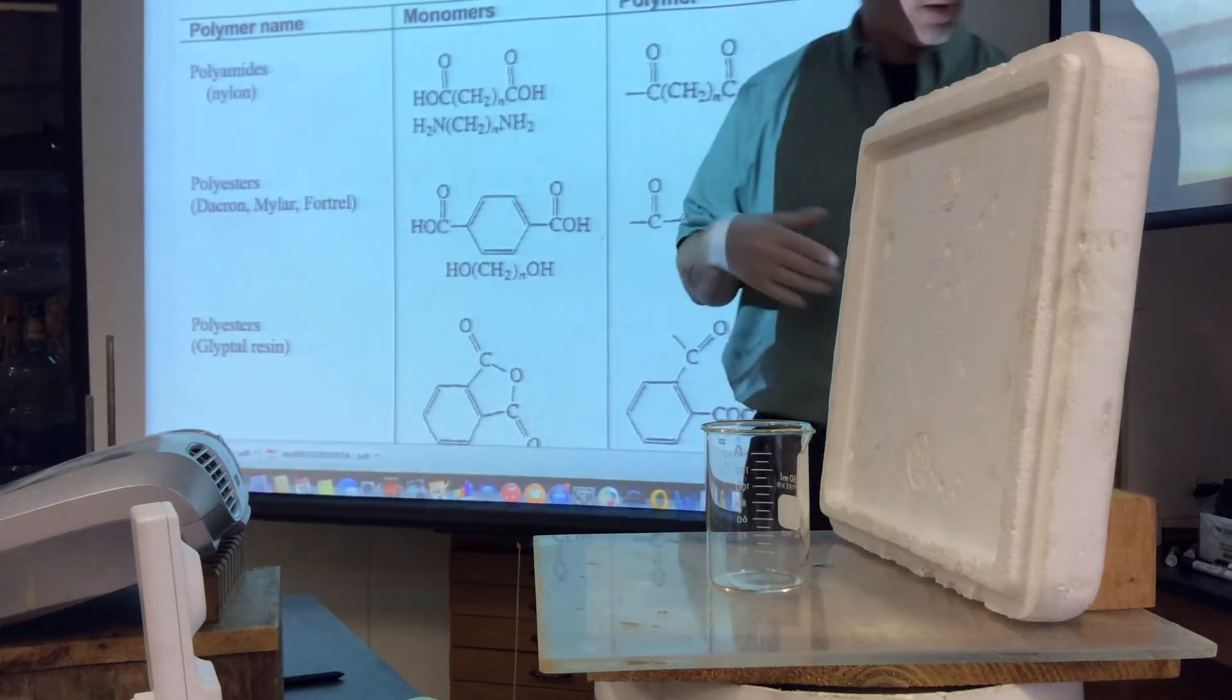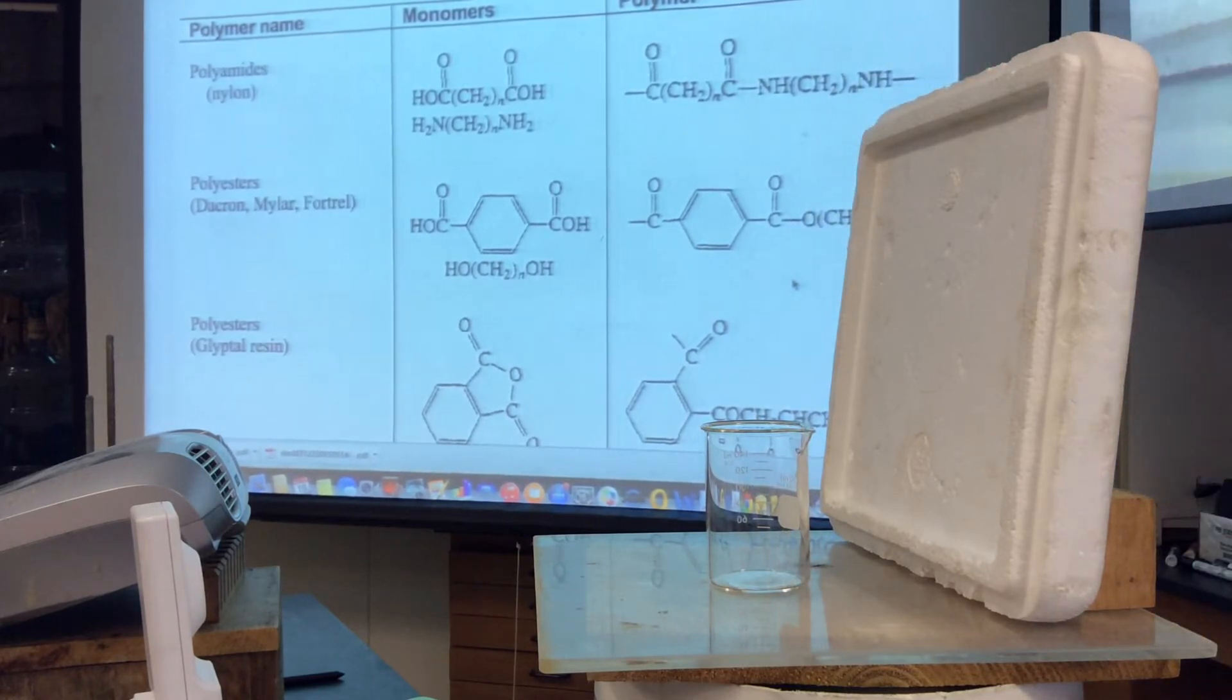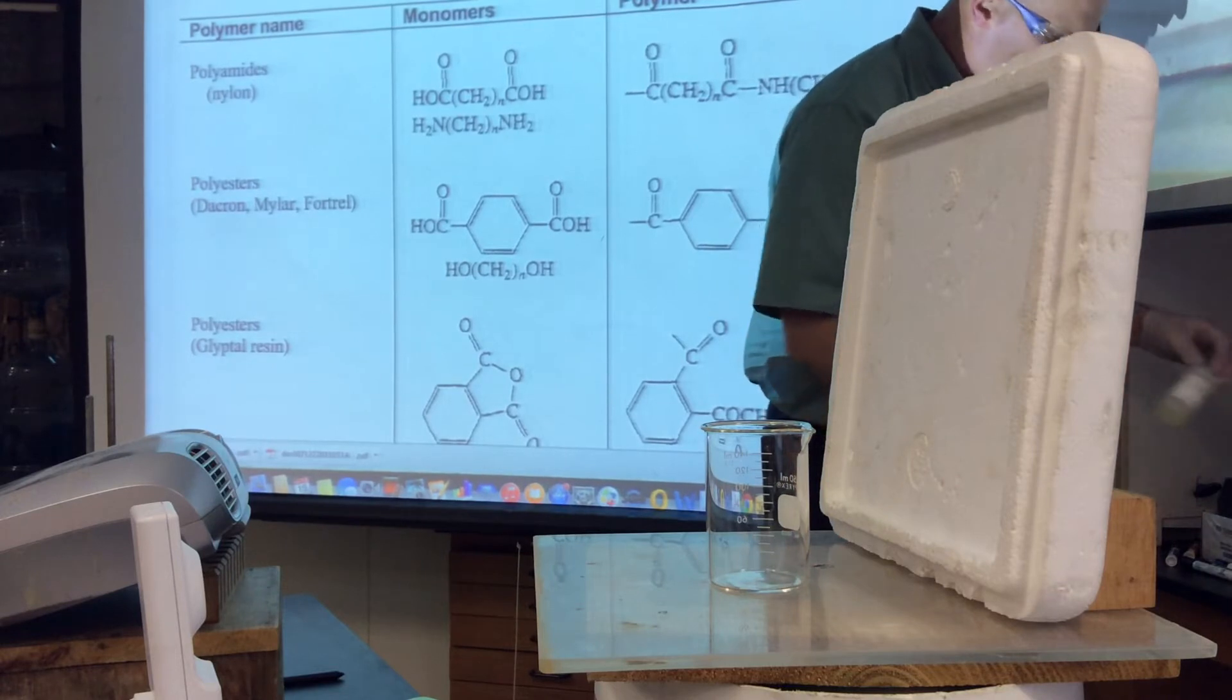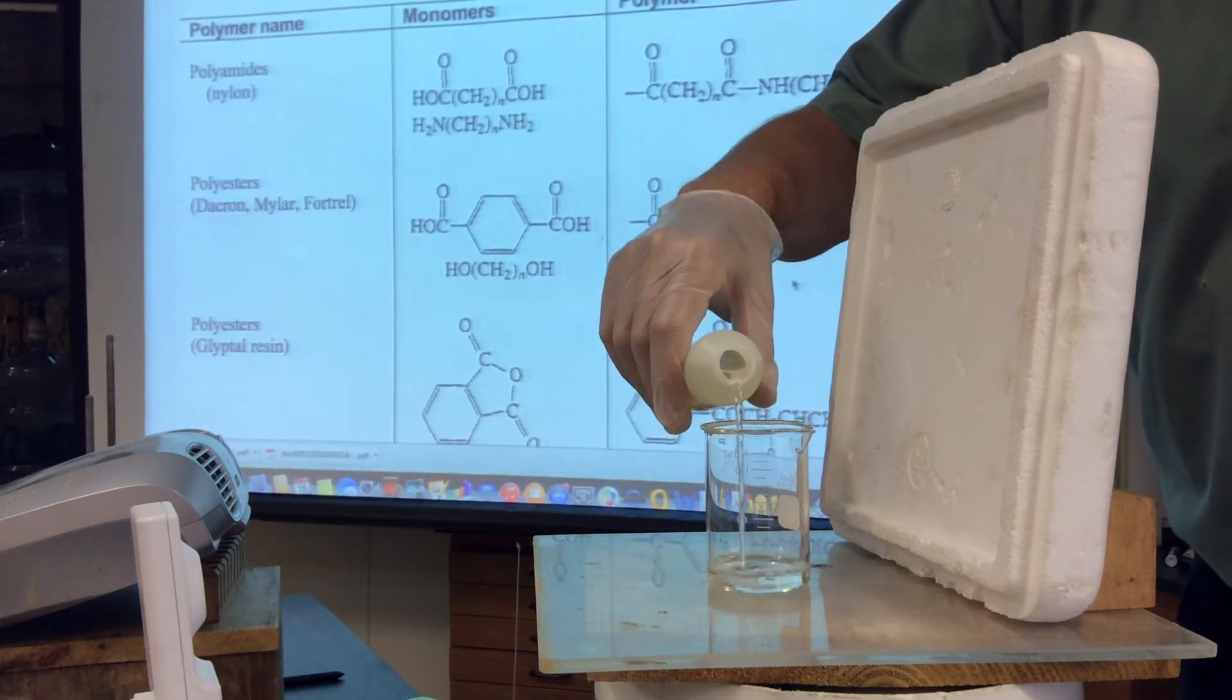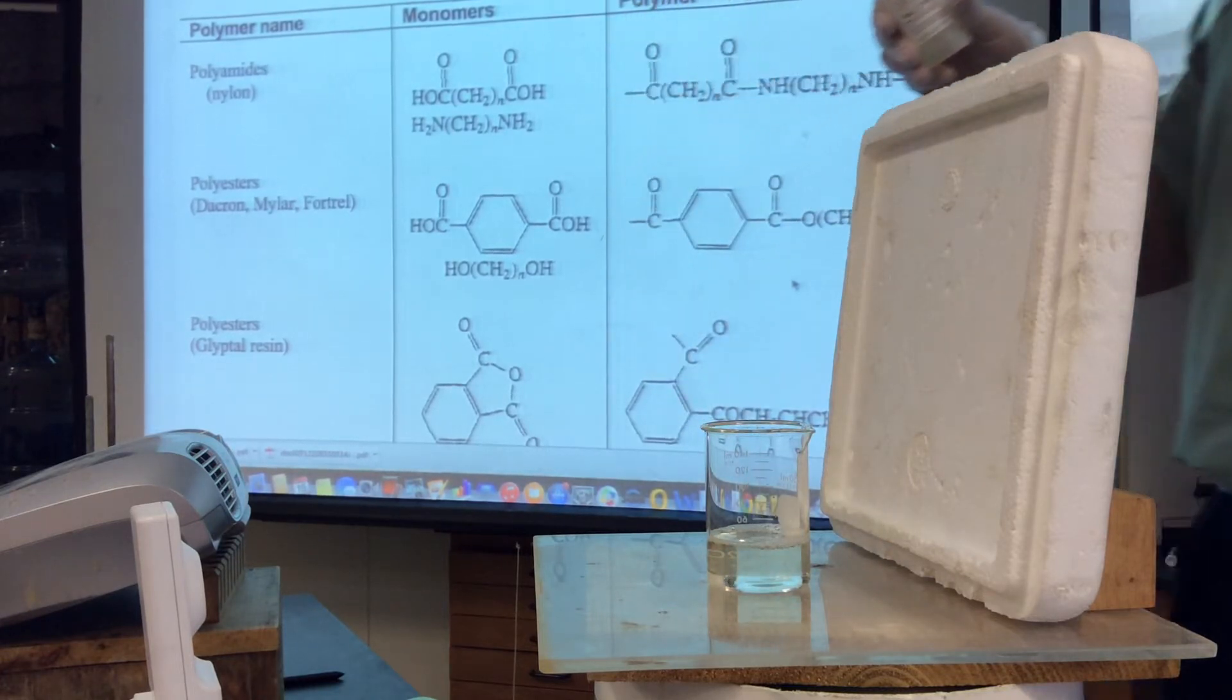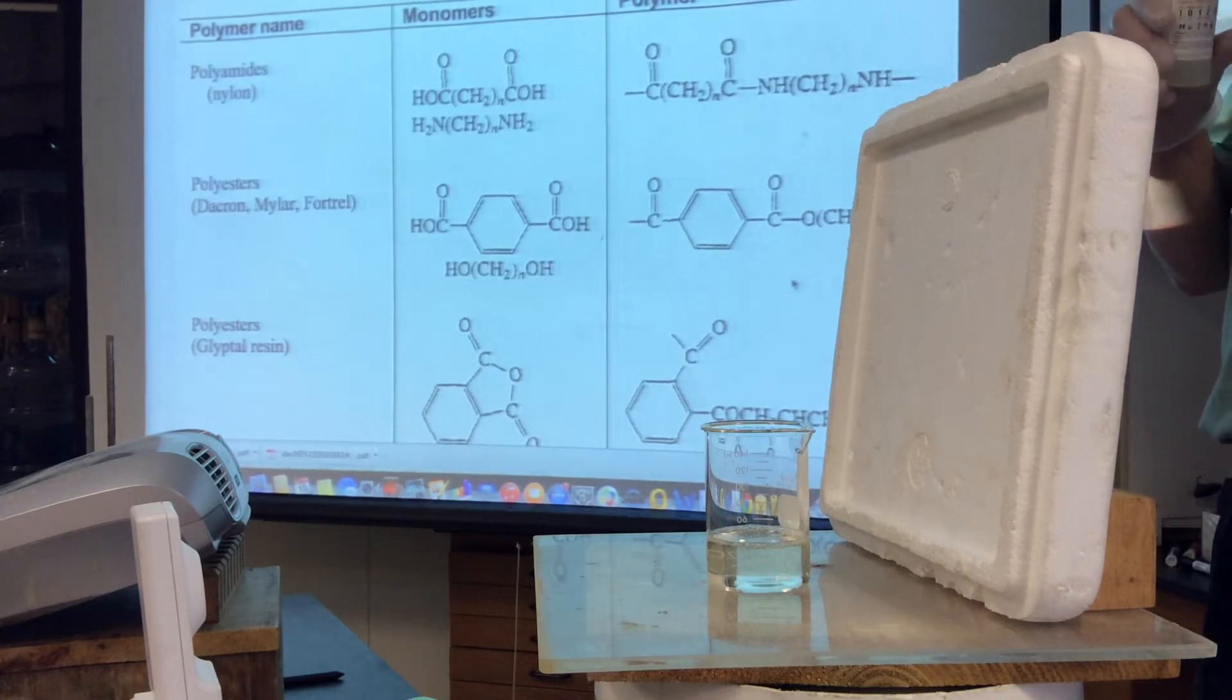So what's cool about doing this reaction is that if you are linking monomers together in a direction, you can actually see a change in the length. So what I'm going to do is start with two chemicals that make this polymer. I just don't want any on myself, so that's why you see me with the gloves. So I'm going to pour some of this. Now, we're learning about organic chemistry. It's hexamethyldiamine. It's got a nice organic name to it.